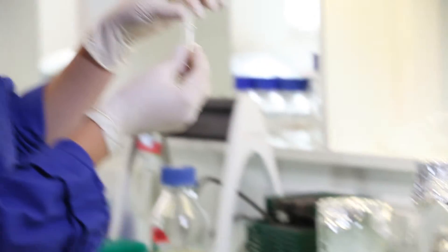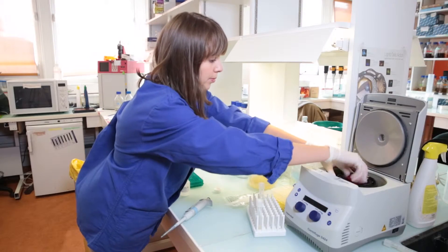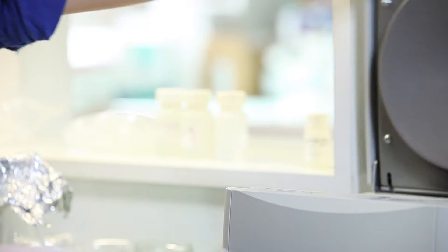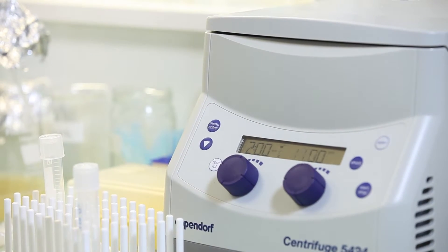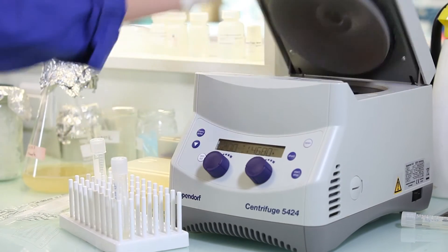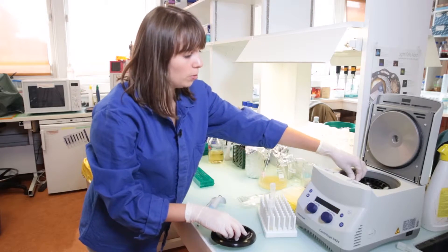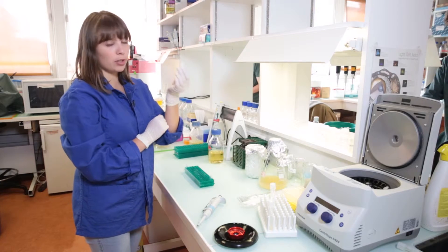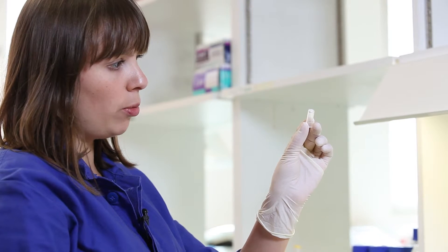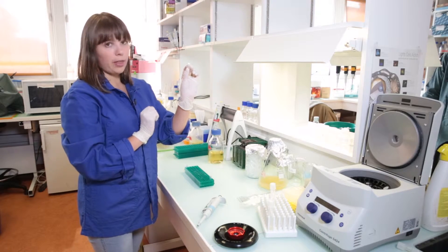We discard the filter flow-through and replace the column. Now we have to dry the column to remove all ethanol. For this we will centrifuge two minutes at maximum speed without any solution added to the column. At this step it's essential to make sure that there is no ethanol left in the tube. If you want to check if there is still ethanol left, you can flick the tube a little bit with your finger. There are no droplets left, so it means that the column is ethanol free.